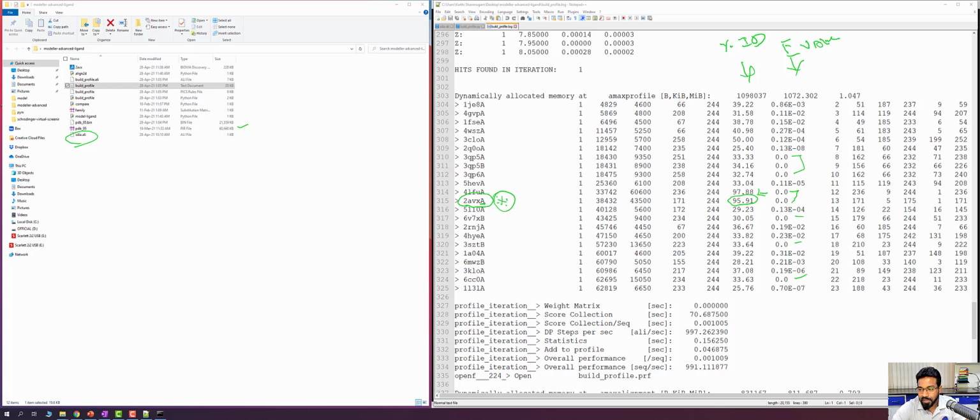So in that aspect, I feel that it is good to choose this 2AVX for this example. So I'm going to choose this 2AVX as the template. I'm not going to run compare, so I leave it to you. If you want, you can run compare.py and make your own choice of which one is the best template. But ensure that the template has a co-crystallized drug molecule or some inhibitor-like ligand molecule.